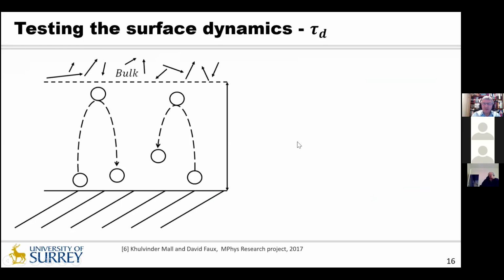And we found out the reason for this, and we sort of dubbed it the nightclub effect. So I don't know if any of you go down a nightclub. I certainly don't. But imagine yourself as a blob here hanging onto the wall with your drink. You can move as fast as these fast-moving molecules out here. But where can you go? You can't go into the wall. You can't move left. There's somebody else there. You can't move to the right. There's somebody else there. So you make a bid for freedom. You move out towards a dance floor where all these fast-moving objects are, but you're battered and sent back to where you came from. So the consequence of this is it's difficult to get away from the surface.